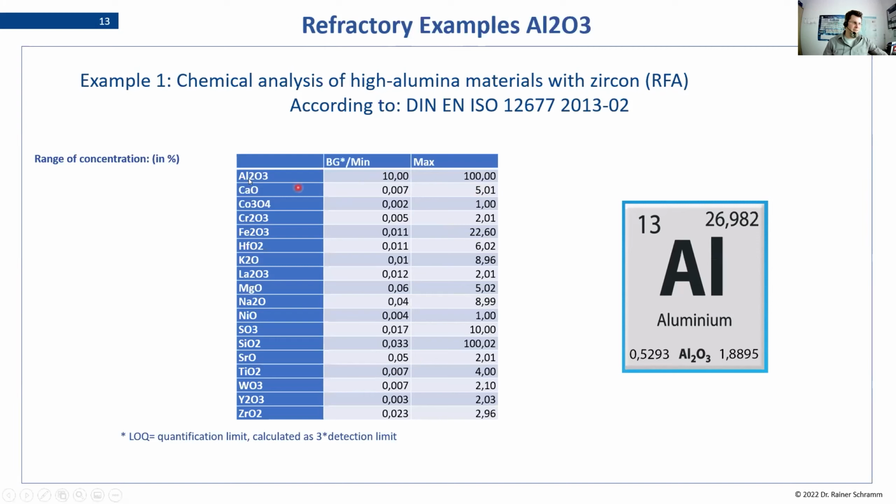So you have the elements here. Remember, we talked about some of the exotic ones, hafnium, yttrium, and also about the impurities, tungsten, and there is some molybdenum here, I think. No, in this case, it's not. Well, we have the ranges here, and it's basically limit of quantitation or minimum value up to maximum. And so this is the definition of your application in this example.